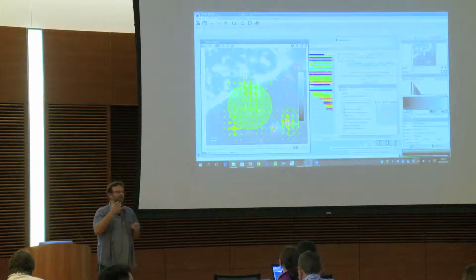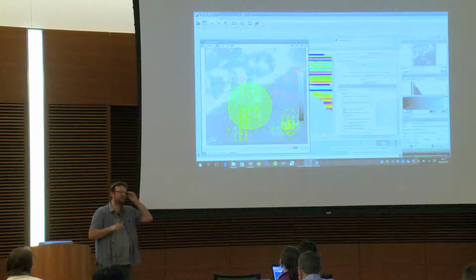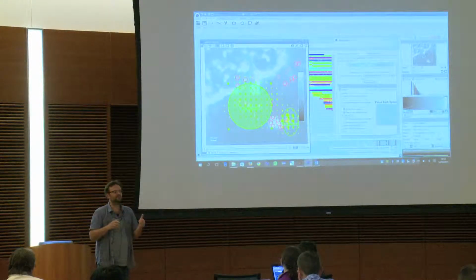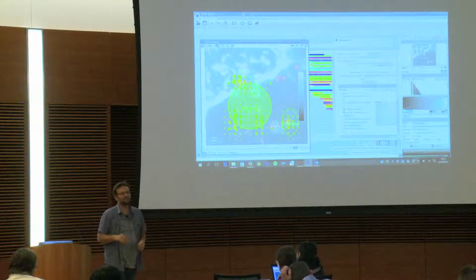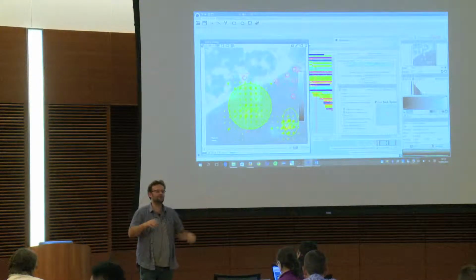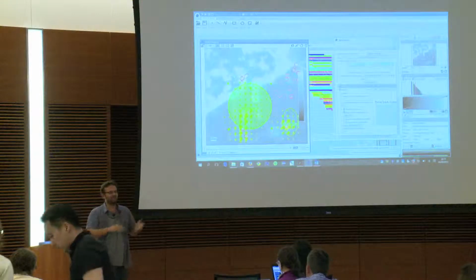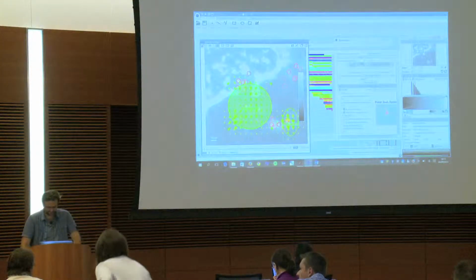So Curtis was speaking about the architecture of the different houses. It's a good thing, and if I had to push on it, you will never see one house that fits everybody. So it's possible to have two very cool houses. And at some point, you see that the socket is the good design in one, and the other is going to copy it, and that's cool. If people want to copy a lot of things from Icy or vice versa, go for it. It is the main idea.